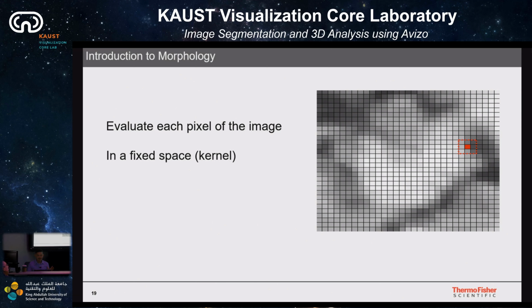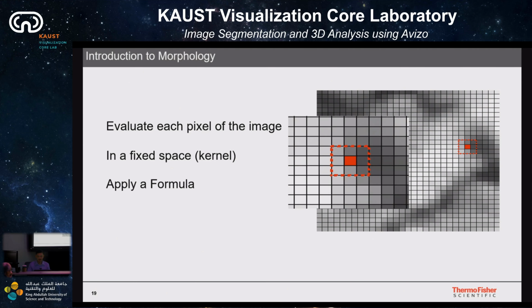this kind of matrix, for example, if you want to do any kind of calculation to average. If you see the center pixel in the kernel, and you look at the matrix, they are connected to the neighboring pixels, so you can see that a maximum of 8 pixels in 2D are connected to it. This is important for image processing. For example, if you would like to apply a filter to smooth or reduce noise, you need to average the intensity information of the center pixel compared to the surrounding. So you use this information for image processing.